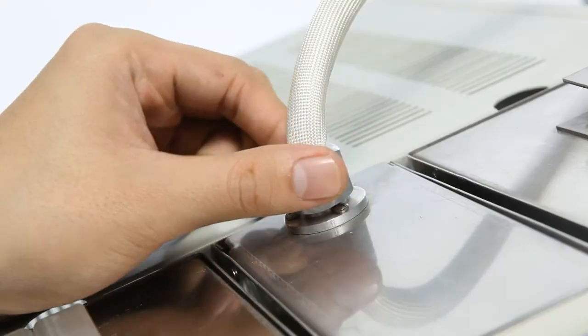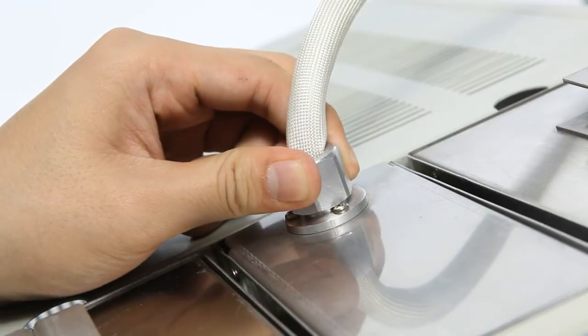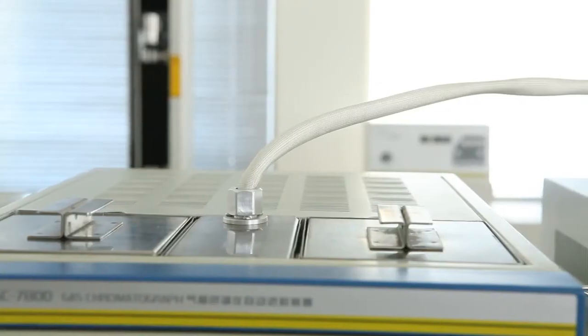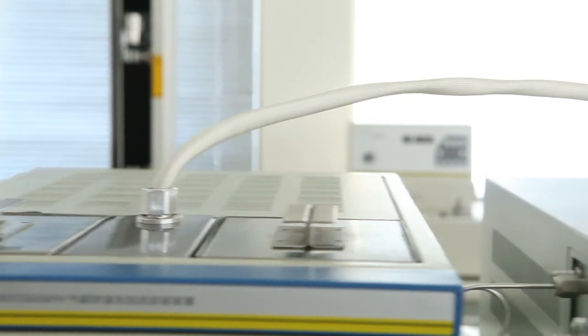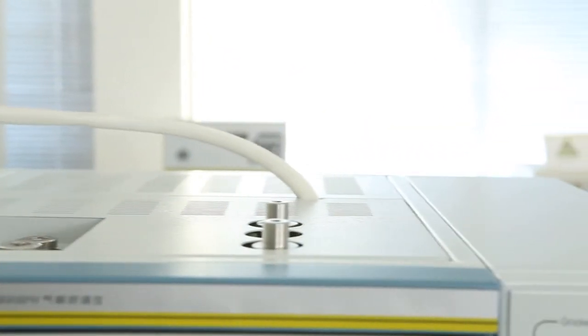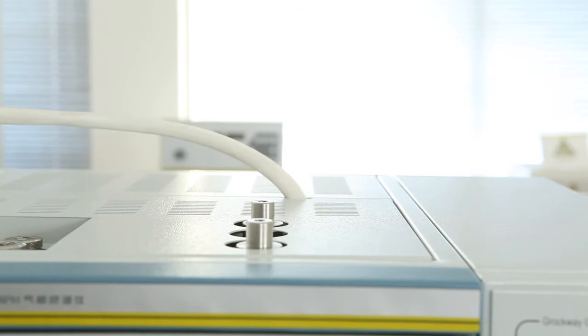The sample transfer line has been chemico physically treated and is temperature controlled in order to prevent sample condensation and absorption. The sophisticated design increases the detection limit and significantly improves the accuracy of test results.